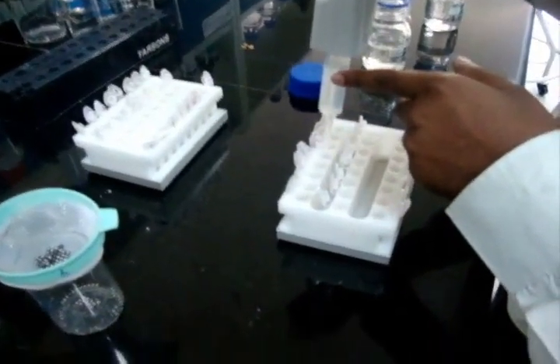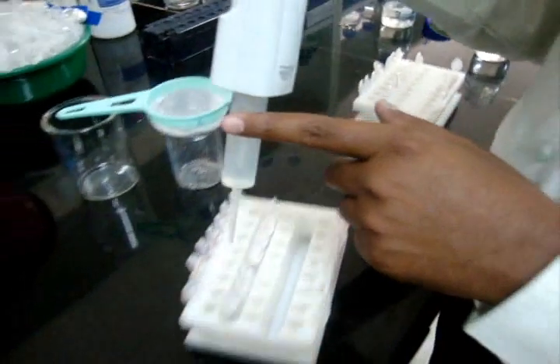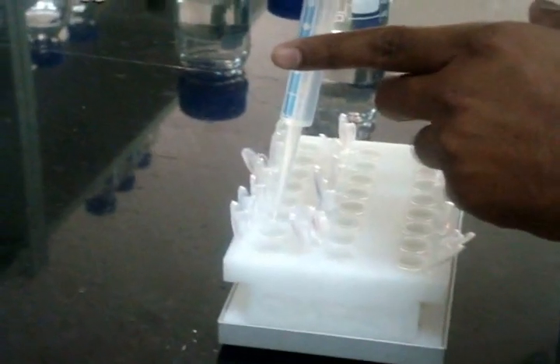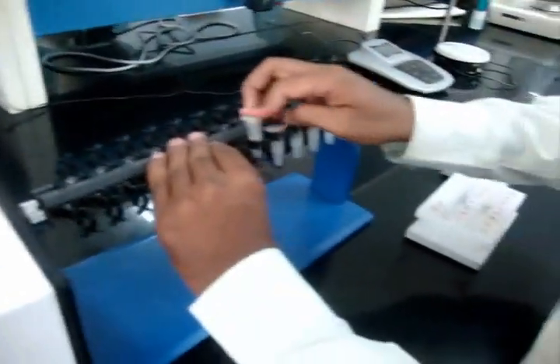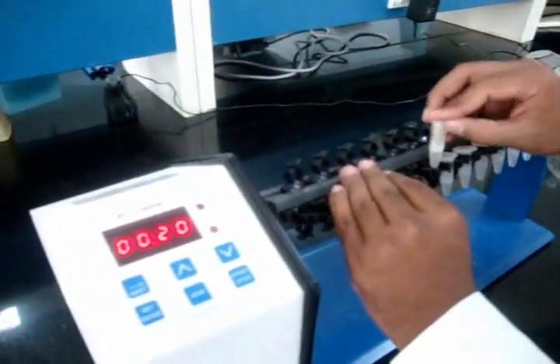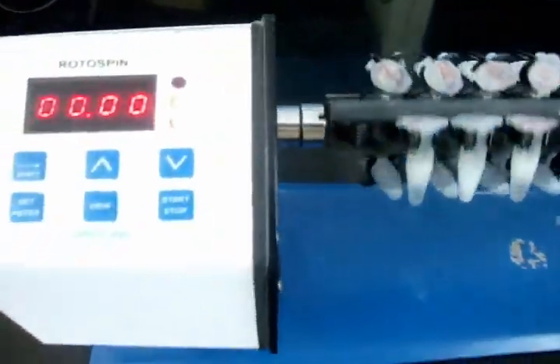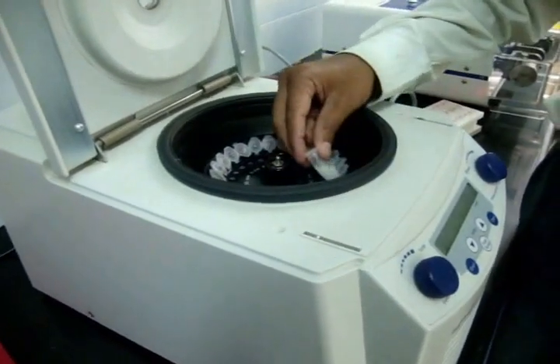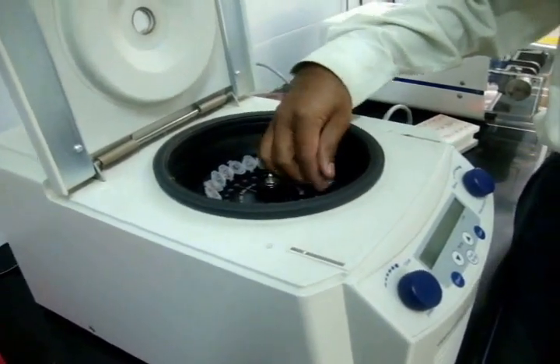Add CTAB buffer into the sample, then add chloroform into the sample. Place the Eppendorf tube into the roto mixture for about 20 minutes, then centrifuge at 13,000 RPM for 10 minutes.